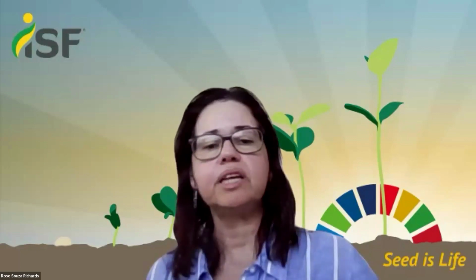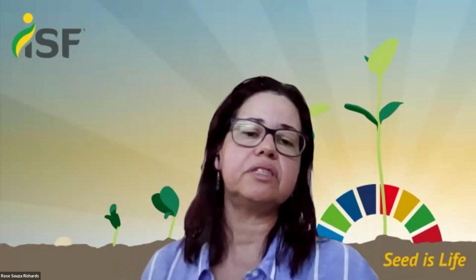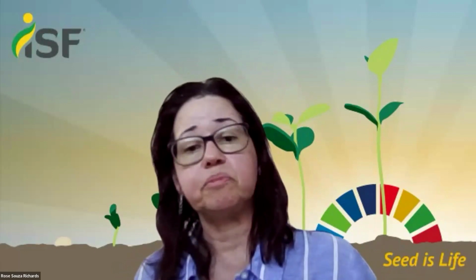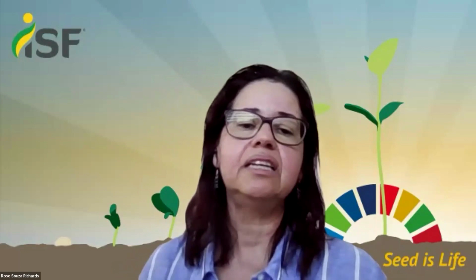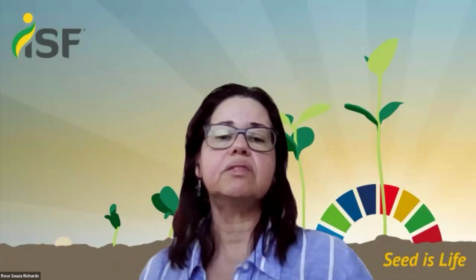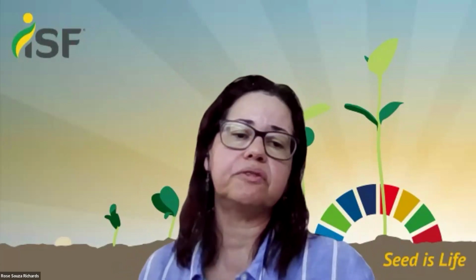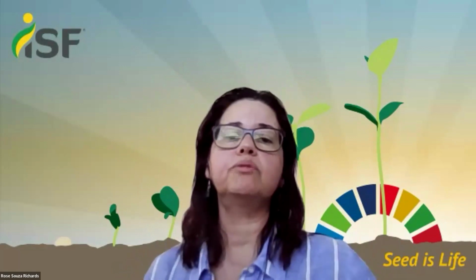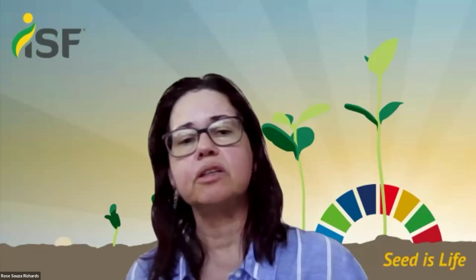Jean-Louis Lafont will dive into data analysis techniques for seed health, focusing on the statistical methods for multi-laboratory collaborative studies, as well as repeatability and reproducibility in seed health tests, aligned with ISO 5725 standards. We'll also be discussing how SeedCalc, a powerful Excel-based tool, can help determine the appropriate sample size for seed health testing. Additionally, we'll explore how tools developed by the ISTA Statistics Committee are applied to both large commercial seed lots and smaller ones to ensure precise data.